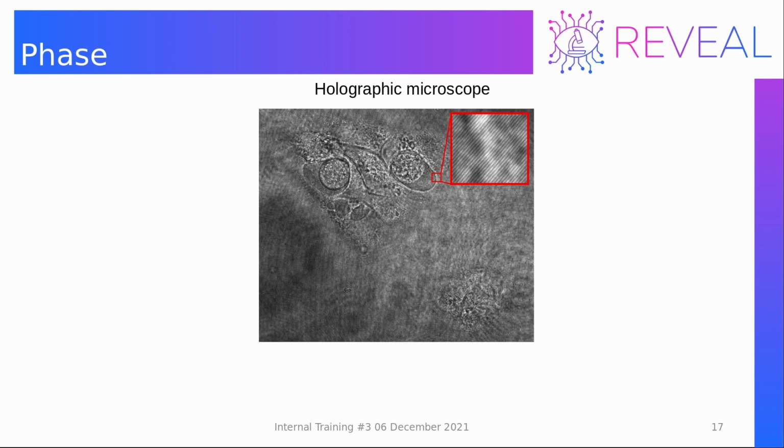Now you can see that the fringes appeared, and the fringes are very dense, so they are not visible with the naked eye here, but if we zoom in to this region, for example, you will see these fringes. These are the same cosine fringes, so if you take the cross-section in this direction, you will see this very dense cosine function.